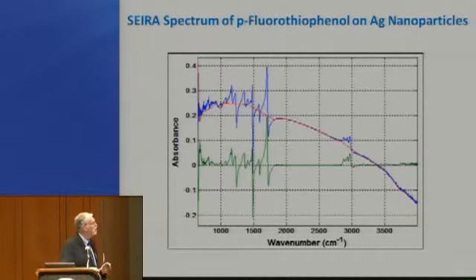So what about bipolar spectra? Well, here's a spectrum of parafluorothiophenol chemisorbed onto silver nanoparticles beyond the percolation limit in size, and you can see that it actually selects the baseline pretty well. And again, this is using the same parameters that we use for Raman spectra, with the only change being what we selected as the first and last data points.